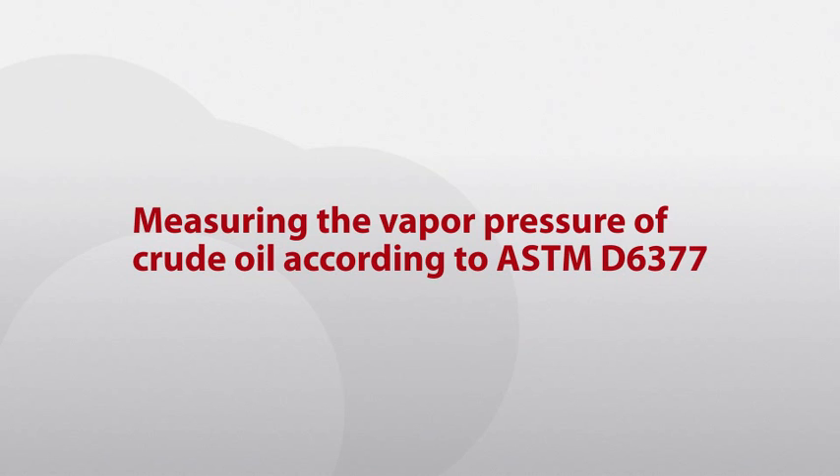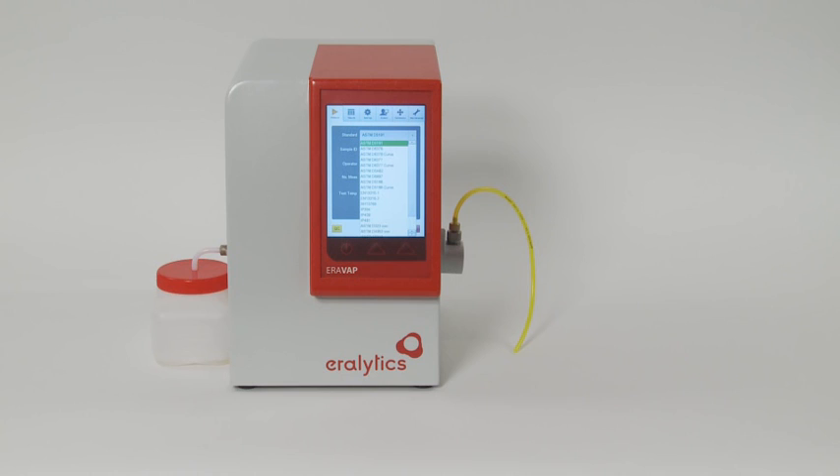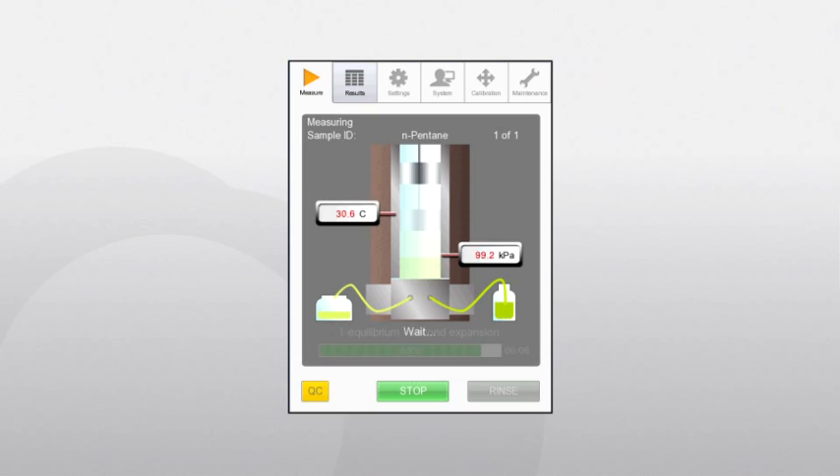Measuring the vapour pressure of crude oil according to ASTM D6377. This method allows two different filling procedures depending on how crude oil is delivered. If the crude oil is filled into a non-pressurized container, the measurement is identical to gasoline testing according to ASTM D6378 — no sample preparation is required. Just select the method D6377, enter the sample ID, select the operator and press Run. The ERAVAP automatically starts to rinse and fill the chamber for the measurement. After a few minutes, the measurement is finished and the result is displayed.